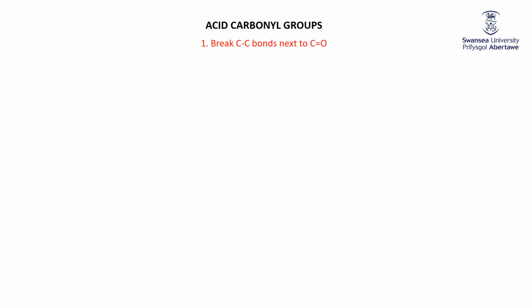Could have done some more on those carbonyls, but A, will save that for the worksheet, and B, they're much of a muchness. A lot of times you will see people say, well, if you've got an aldehyde, then you will see the result of losing that H. Well, of course, losing that H is the same thing we've just seen, making the acylium ion that's just one less than the molecular ion.